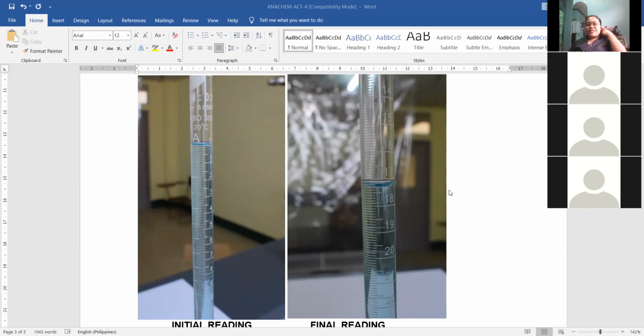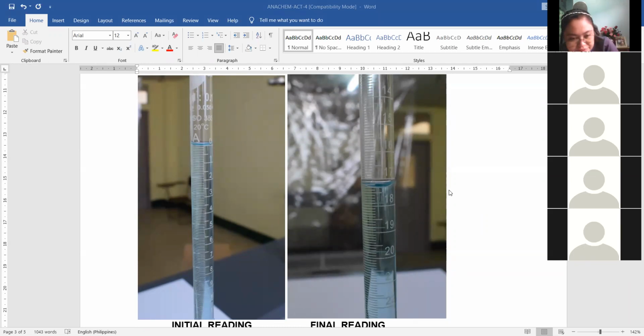Okay? Questions? Wala? Mecca, nasabtan to Mecca? Yes, Eden. Pag mag-reading, doon sa final, ma'am, sa lower meniscus, ma'am. Yeah, lower meniscus kasi as you can see the solution, it's color blue but it's a clear solution.